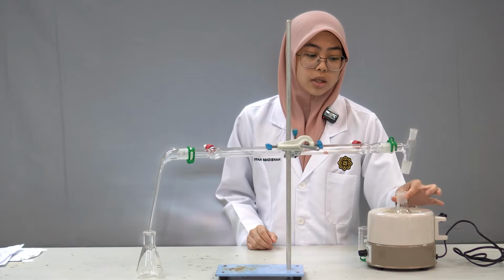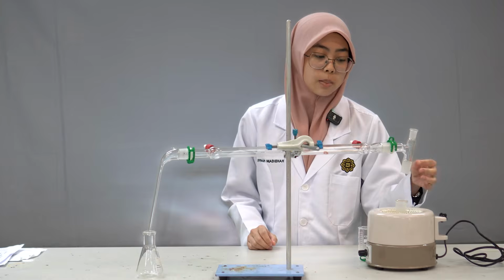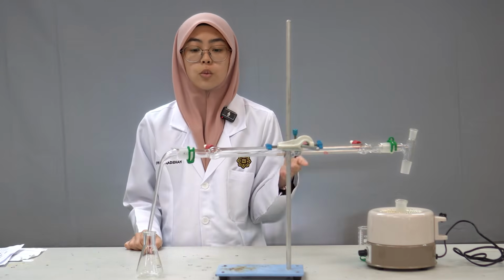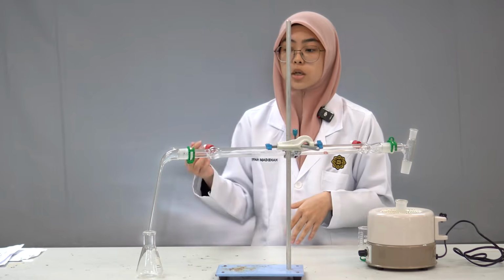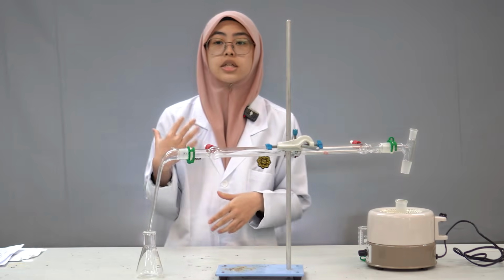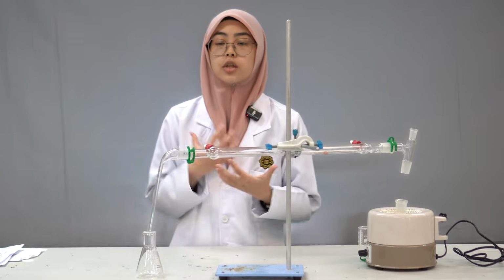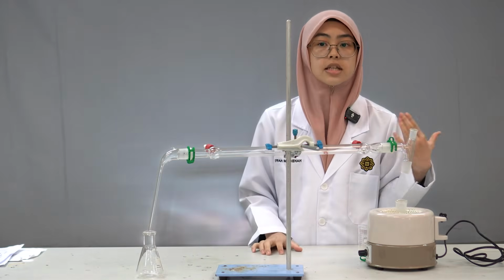So then we will put it into the heating mantle. But before we turn on the heating mantle, we need to make sure of our water flow. We will flow the water from the bottom to the top, so that the water will coat the entire condenser, so it will increase the cooling efficiency. So the vapor will turn into liquid more efficiently. And then this is the next precaution.